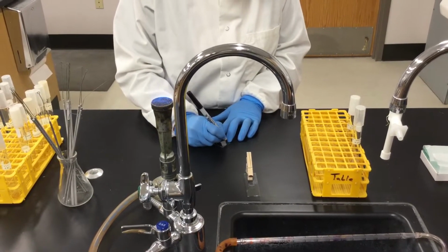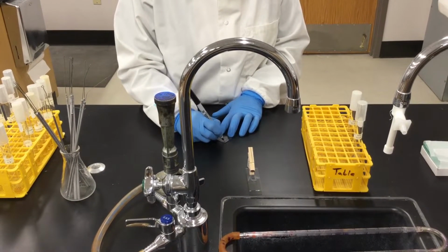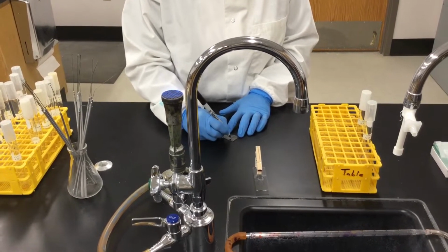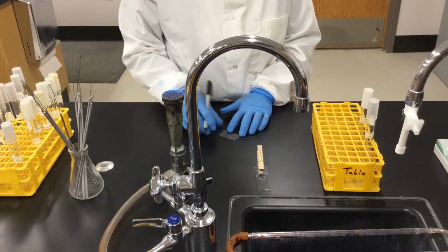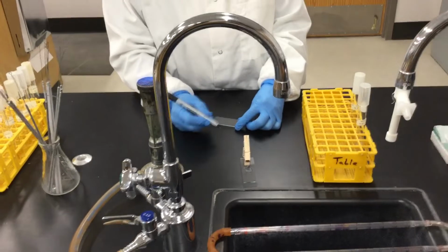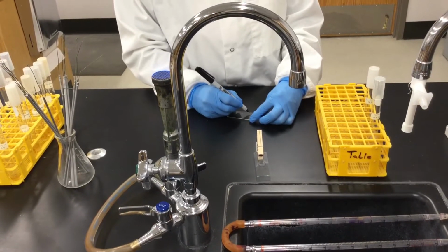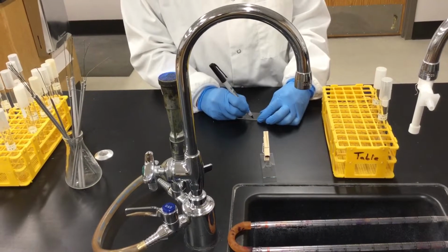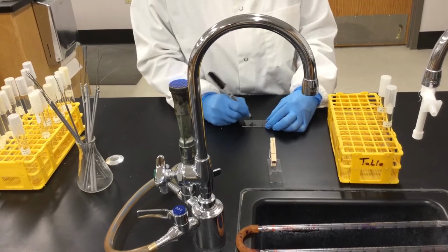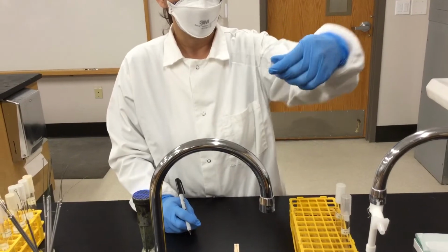And again, it's the same bacteria, but now it's going to be in a solid media. Use Micrococcus luteus, put the date on the slide, and then your initials. And then again, label the bottom. In this case, because it's a solid media, instead of putting a circle there, I'm going to draw two lines on the bottom of the slide, opposite to where you label your glass slide. So that's the bottom, this is the top.